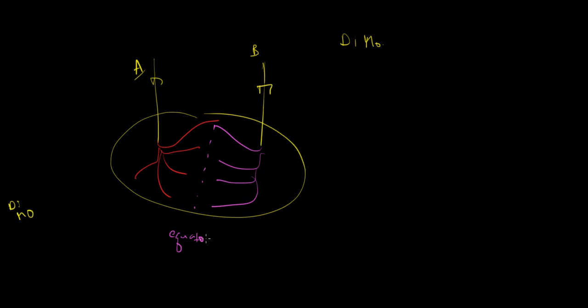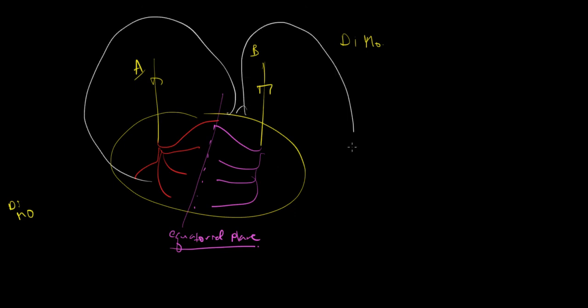There's usually an equatorial plane, and you need to assess the equatorial plane to see where it is. And by the way, the equatorial plane is usually not where the dividing membranes are. So the division of the vascular territories between the two fetuses are not usually the same place. This might be where the membranes come off and divide the two fetuses. And the vascular equator is here. So the placental disc is shared here, but the membrane division is here. So don't make the mistake of assuming that the point of the dividing membranes is the point of the vascular equator.